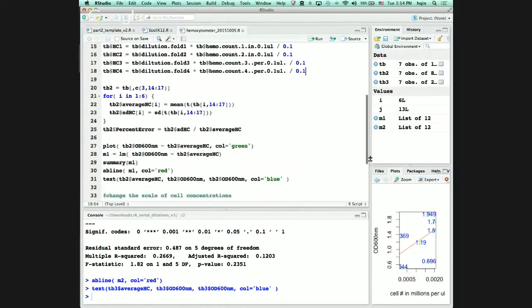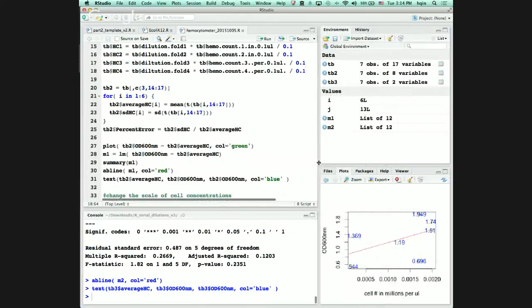Where do you download all that and just install? So you have not extracted any file. That's the problem.